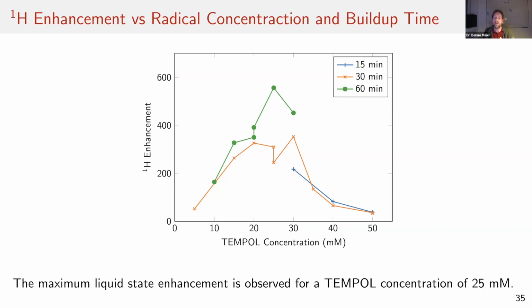A weak binder may have a binding constant of, say, 200 or 500 micromolar. And that's the binding constant you can measure with NMR because that's the concentration that you can observe with NMR. Now, as the binding gets stronger, so you basically go more towards a proper drug, then the binding constant becomes smaller. So then you have maybe a binding constant of 1 micromolar, 100 nanomolar, and so on.